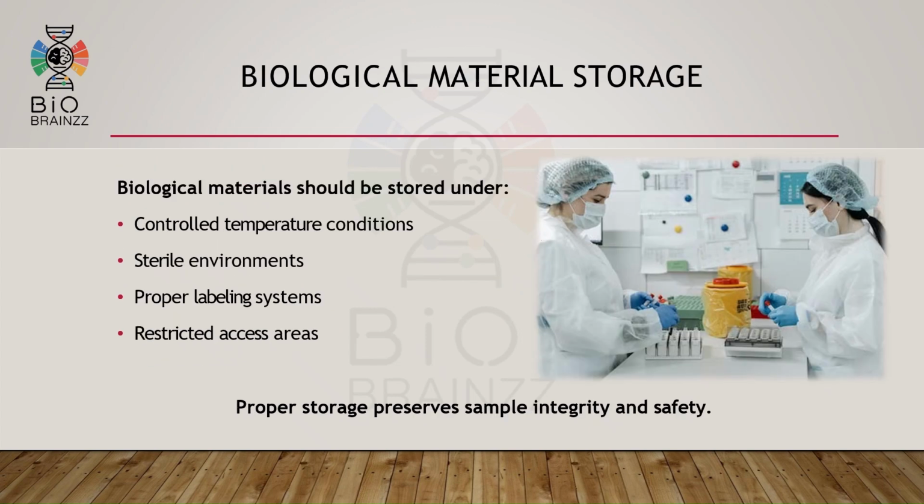Biological materials require controlled storage conditions. Samples should be stored at appropriate temperatures and in sterile environments. Proper labeling systems should be maintained for easy identification and traceability. Access to storage areas should be restricted to authorized personnel only. Proper storage helps maintain sample integrity and laboratory safety.